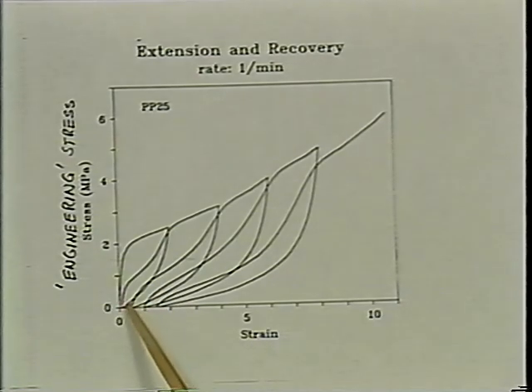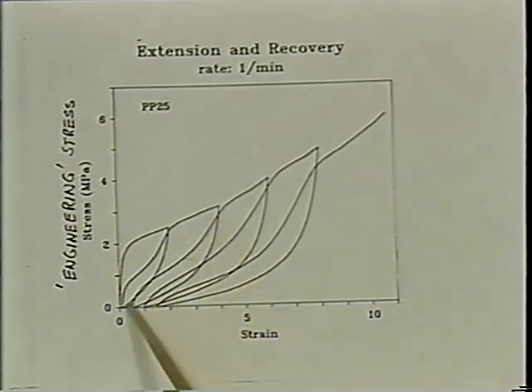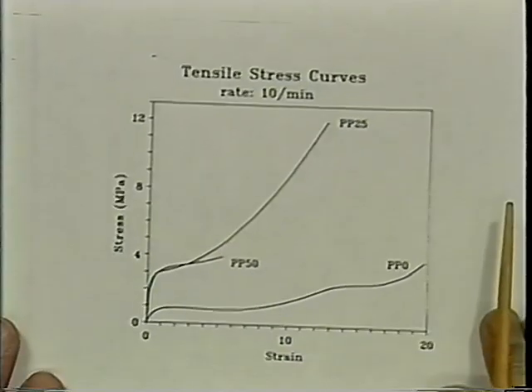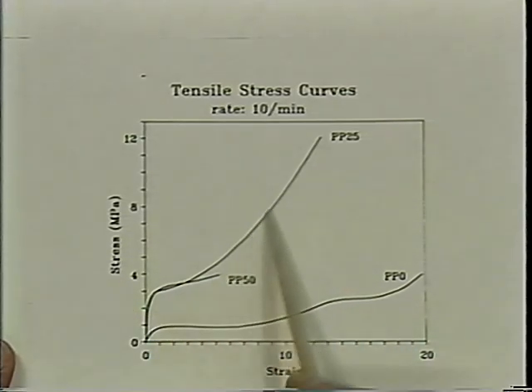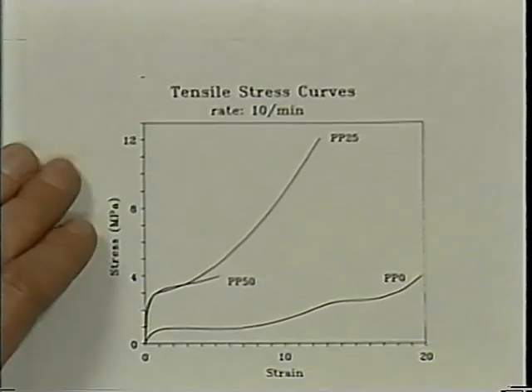Since in the second experiment, when going to larger strains, the material is softer now, and you can break it further, and it still recovers, break it further. So eventually, you can really deform this material to very large strains, and here you have the evolving stress in that system. So it's a very nice thermoplastic elastomeric material, very, very useful.